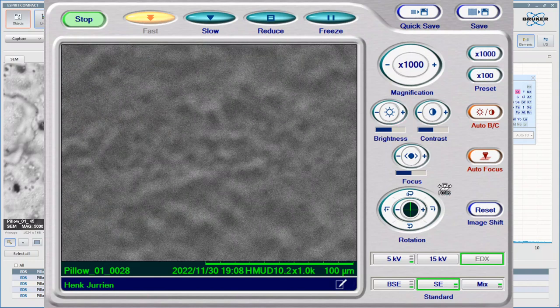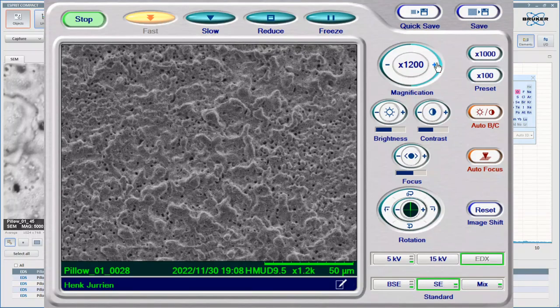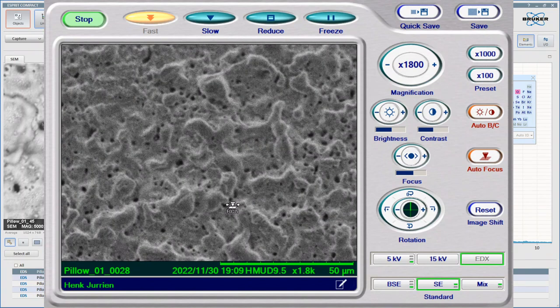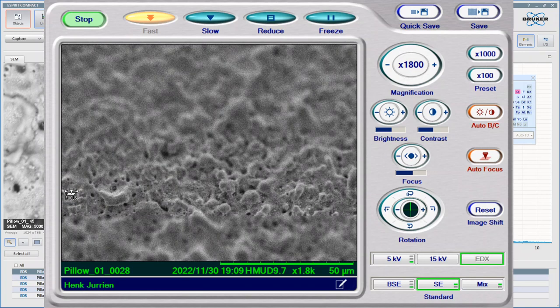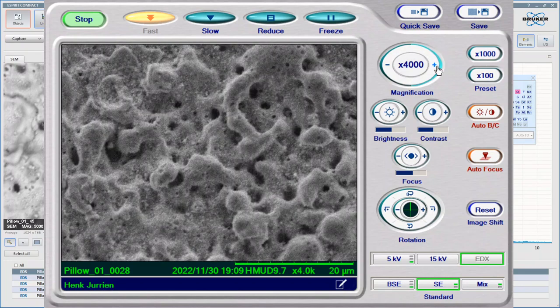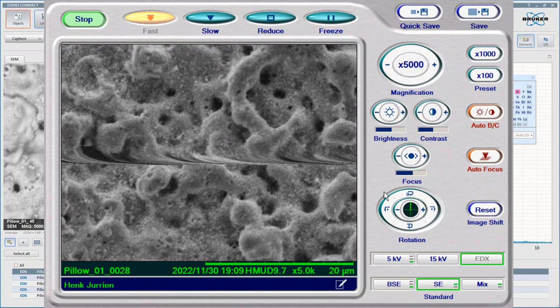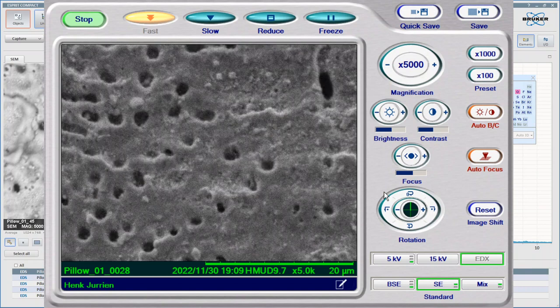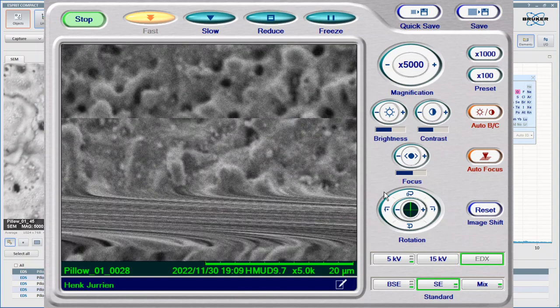So we will need to go in and focus, and you'll see, look at this. It's intensely disrupted. It's like layers upon layers of this kind of holey action going on. Again, things kind of appearing in the center of these, but not always. Major rolling shutter on an SEM like this. It is what it is.